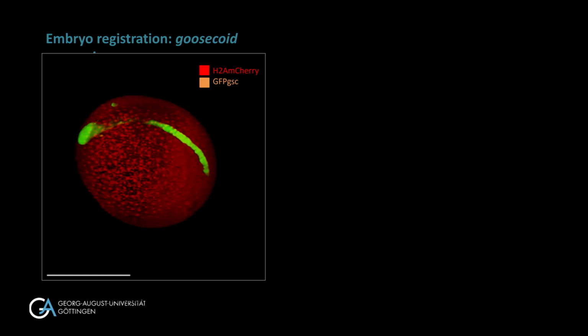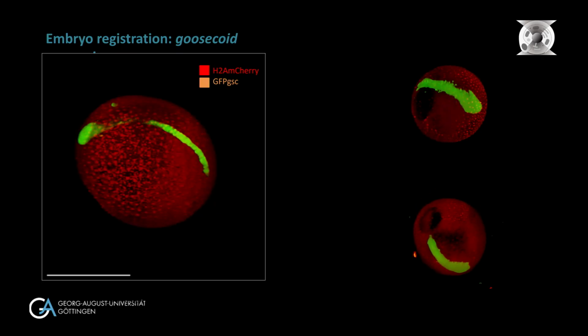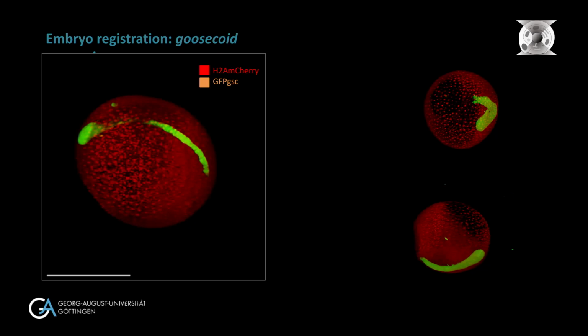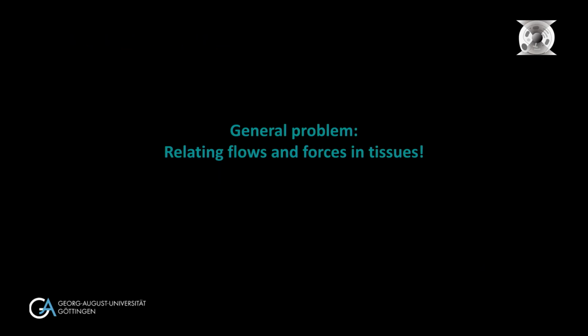And I'll just go back here. And then he used the flow fields to organize and reorient these embryos. So he didn't use the green signal, he only used the flow fields I showed you. And you can see quite nicely that in the end you can register these embryos, and we have this biological confirmation. So with this at hand, we can now hopefully do the overlay of many measurements with all of these beads, so that we can get a visual representation of the forces involved there and then match that with the flows. But this is something that we're doing now, that's going on.